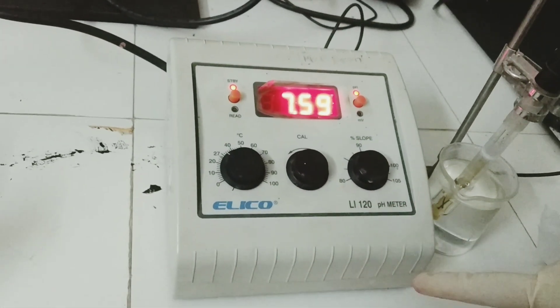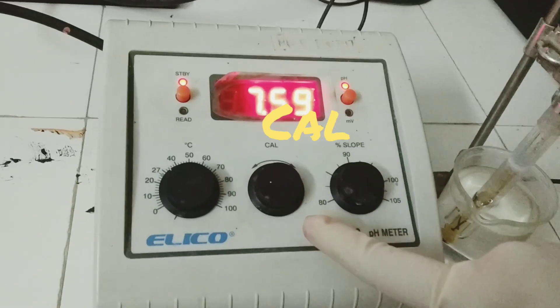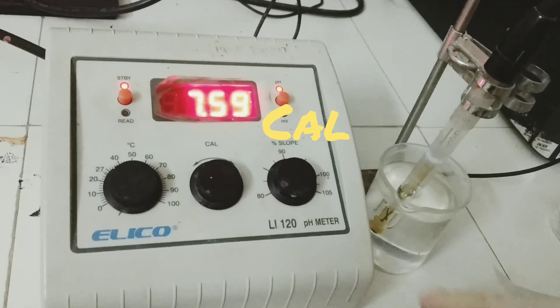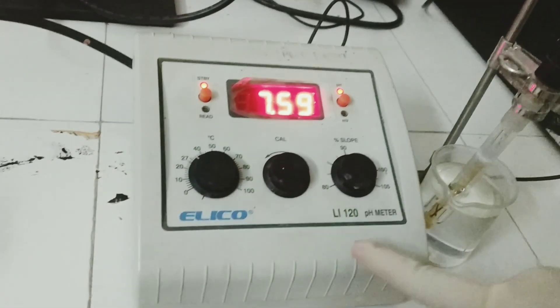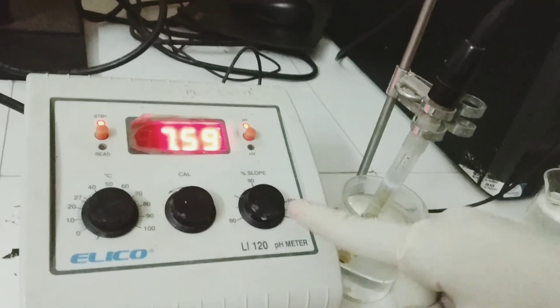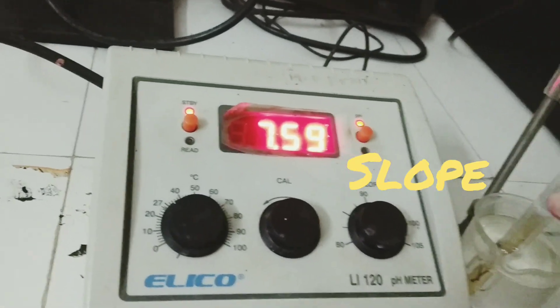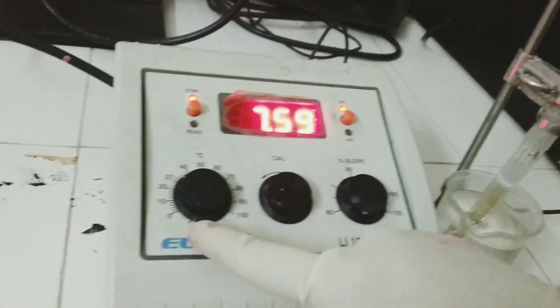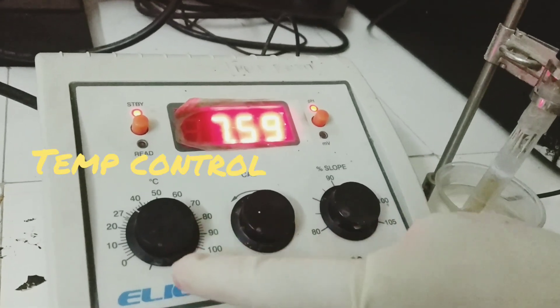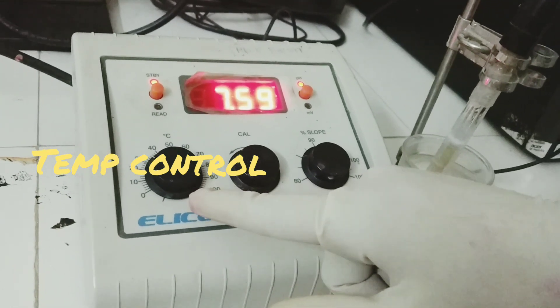Here you can see three knobs. One is the cal knob, which is used to adjust the pH of a solution when the electrode is dipped into a solution of known pH — to adjust a standard pH value. The other knob called slope is used to calibrate the sensitivity of the electrode. The third knob showing degrees centigrade allows us to adjust the temperature. Usually we put it in room temperature mode when we start the experiment.